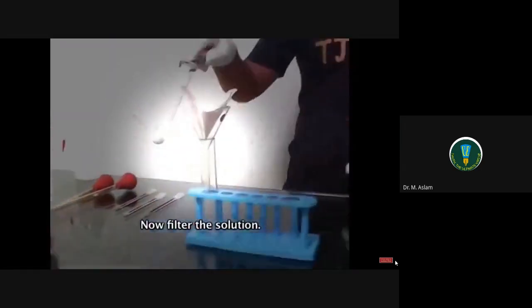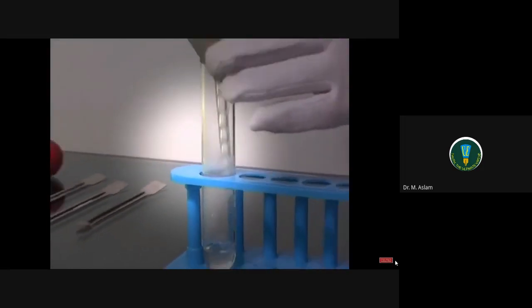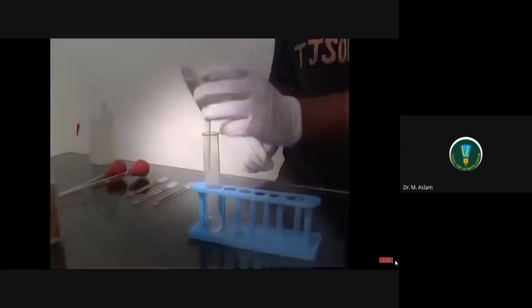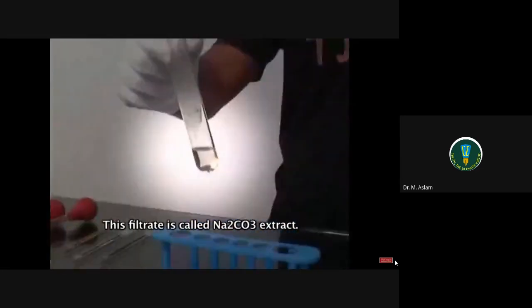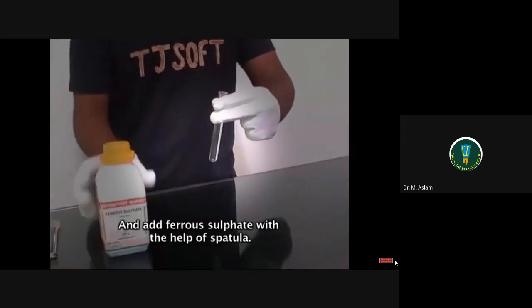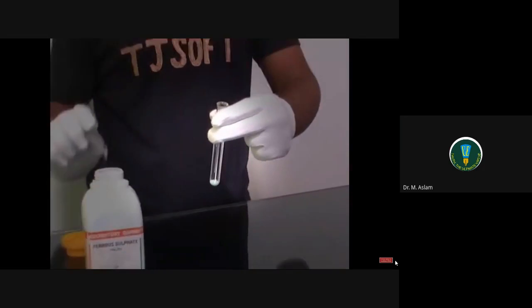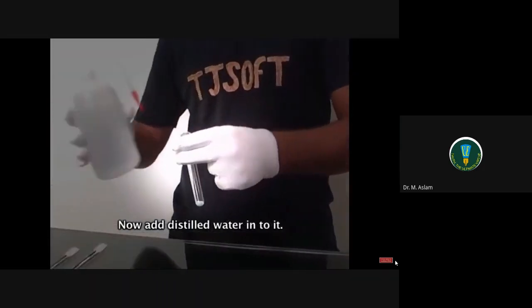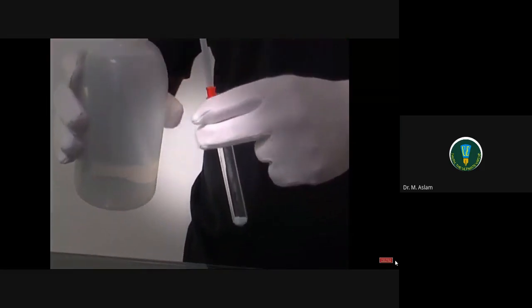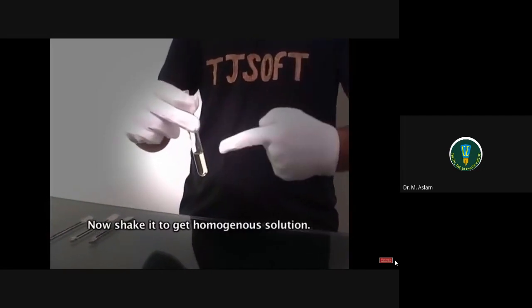Now filter the solution. This filtrate is called Na2CO3 extract. Now we will prepare ferrous sulfate solution. Take a test tube and add ferrous sulfate with the help of a spatula. Now add distilled water into it. Now shake it to get a homogeneous solution.